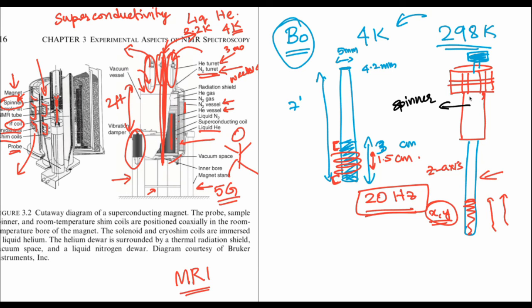And at the same time, make sure you lift the sample, meaning that in the software you end up using, you will have to type a command which will eject the previous sample and then you have to insert the next sample by carefully removing whatever was inside and putting the next one inside it.